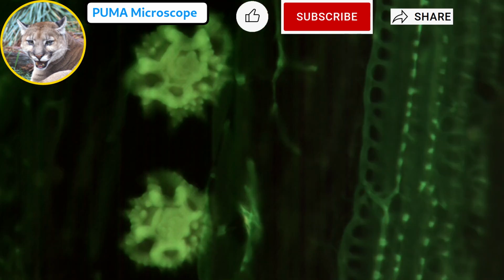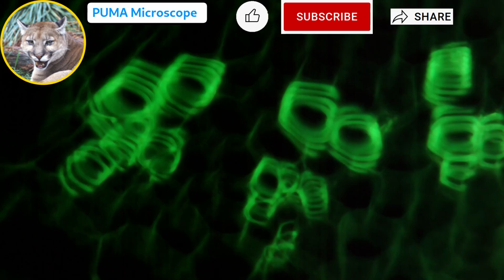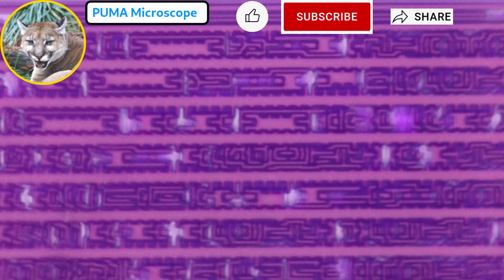Other forms of Epi-illumination are possible with this apparatus, in addition to the examples shown in this video, such as backscatter dark field and oblique Epi-illumination. Details of the various types of Epi-illumination that can be achieved and experiments using Epi-illumination will be the subject of separate tutorials.